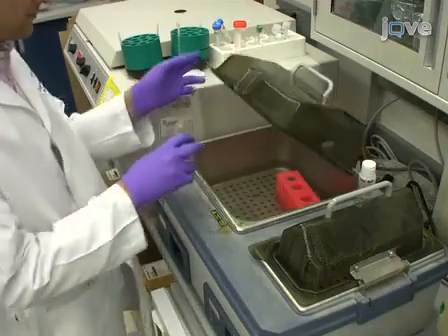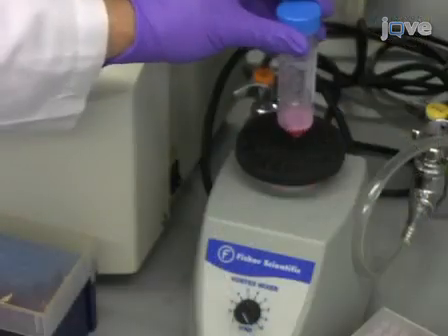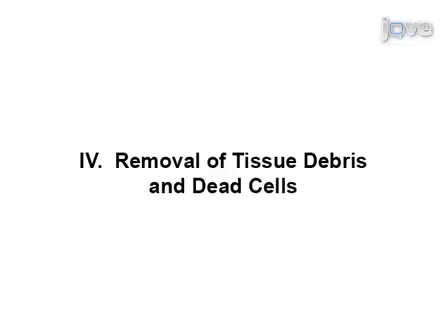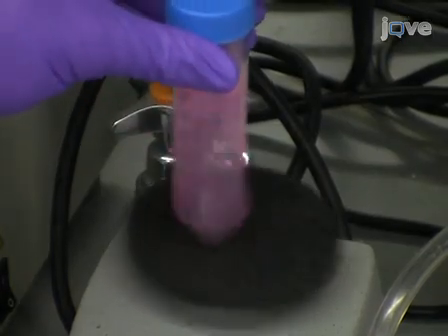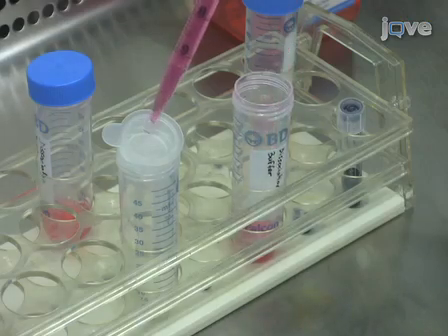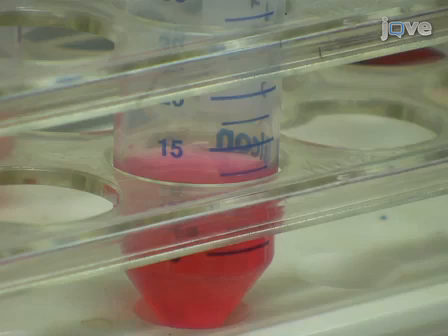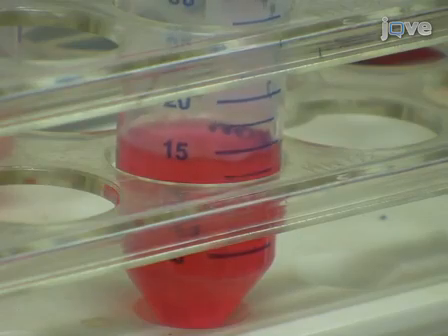Then, incubate the tumor cell suspension at 37 degrees Celsius for 2 hours, vortexing for 1 minute every 20 minutes. After the 2-hour incubation, vortex the cell suspension at maximum speed for 1 minute. Pass the cell suspension through a 70-micron filter and collect it in a fresh 50 milliliter conical tube. Adjust the final volume to 15 milliliters with DMEM containing 10% FBS and pen strep.